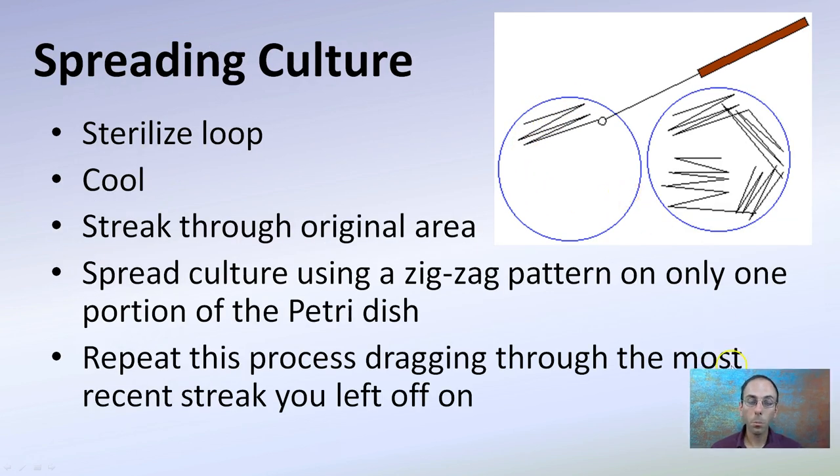Then we're going to spread that culture. You want to sterilize the loop and allow it to cool again — that cooling step, I can't stress that enough. Streak through the original area and spread cultures using that same zigzag pattern on only one portion of the petri dish. Repeat this process, dragging through the most recent streak you left off on. Here was our initial streak, and the next one drags through that initial one in the zigzag pattern again. Re-sterilize the loop, put it back down, go through that initial streak, back and forth. This helps ensure we're spreading that bacteria out well.